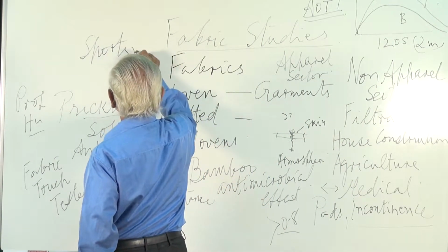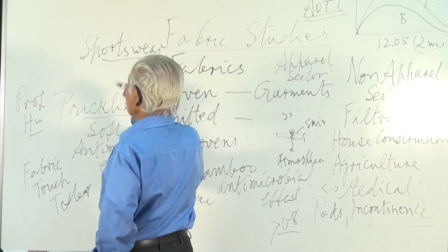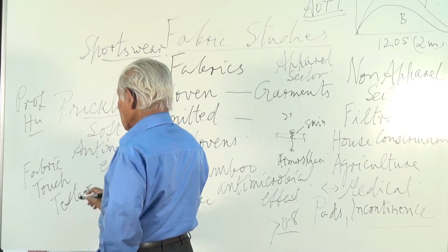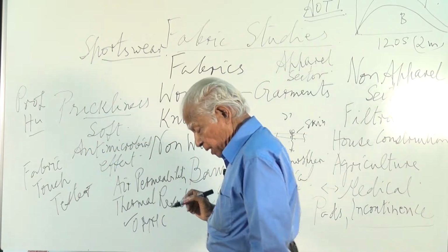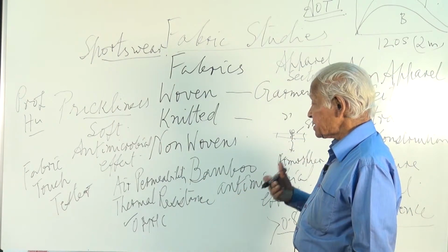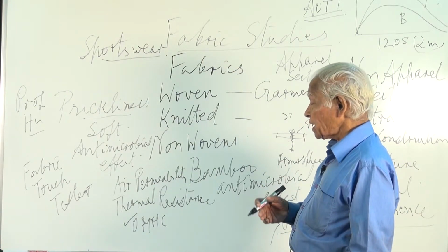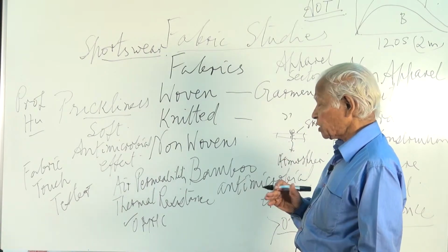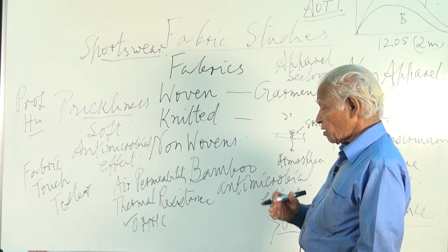Today a sportswear is a knitted fabric, and it should absorb moisture. And to judge the performance of the sportswear, this overall moisture management control tester can be used. And attempts are also being made to confer these comfort characteristics to 100% polyester fabrics, because we know that the 100% polyester fabrics in comparison with 100% cotton fabrics are not comfortable, because they are not capable of absorbing the sweat or absorbing the moisture.